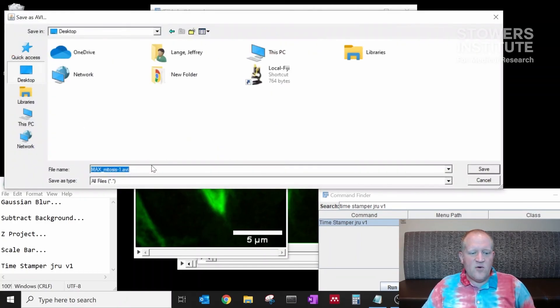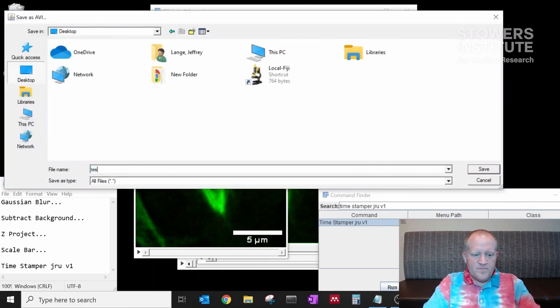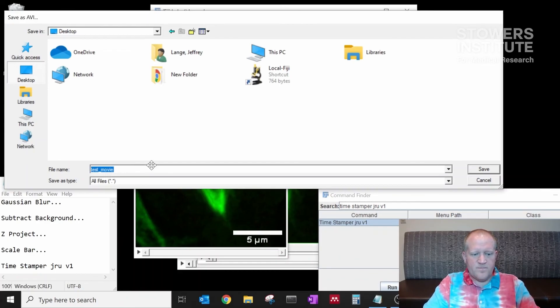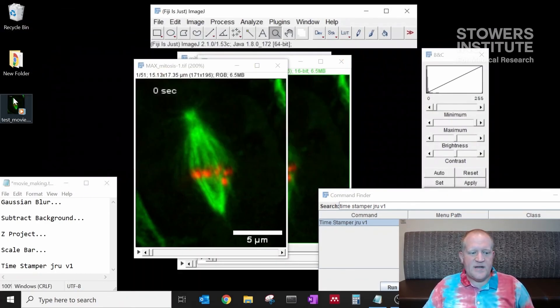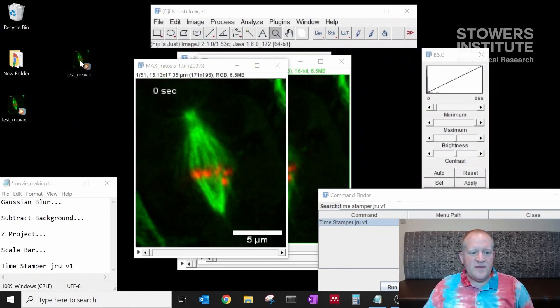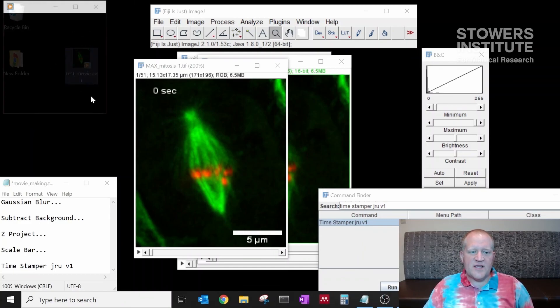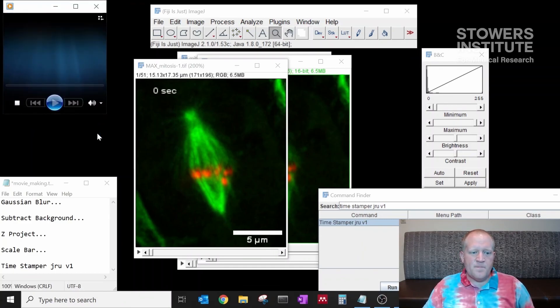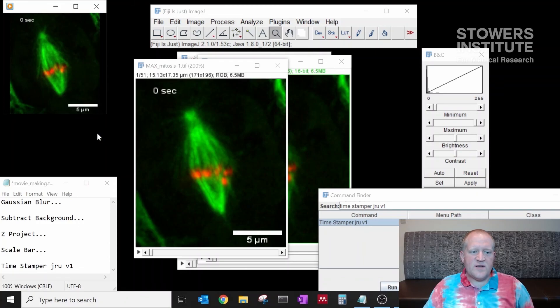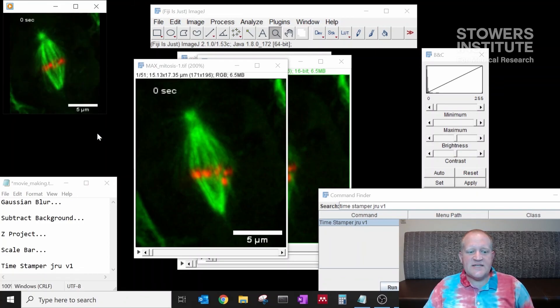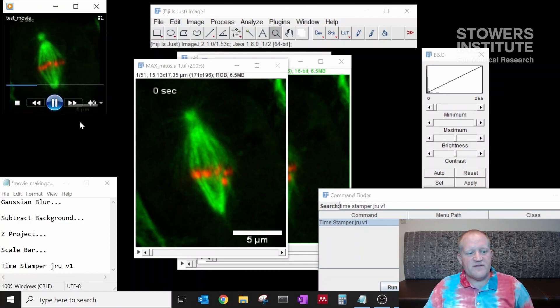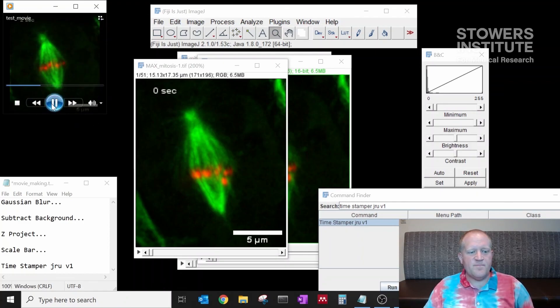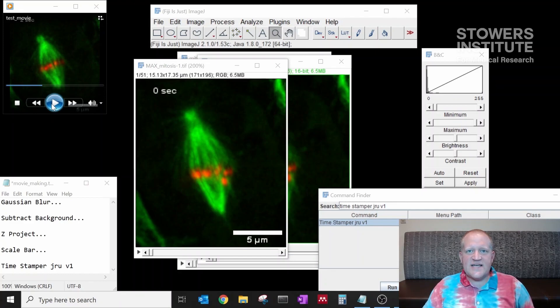Now I can save my movie to the desktop. And now I have a new movie that is an AVI file that when I double click, I can play in Windows. It has the timestamp intact, and it also has the scale bar intact. And this will take about 25 seconds to play. So that was making a movie with Fiji of your data set. Thank you very much for watching.